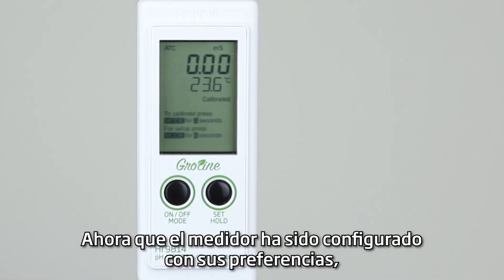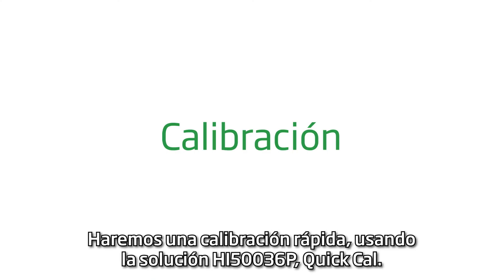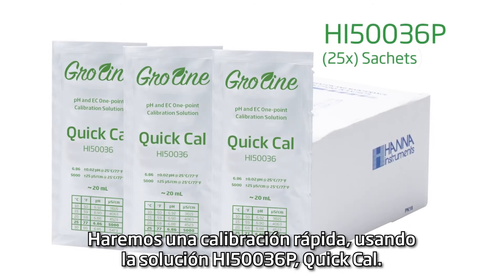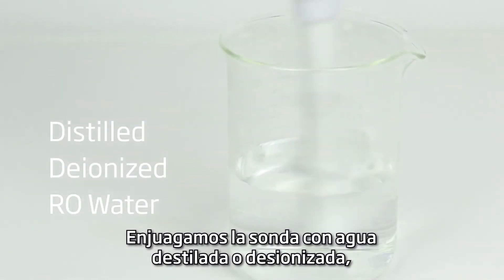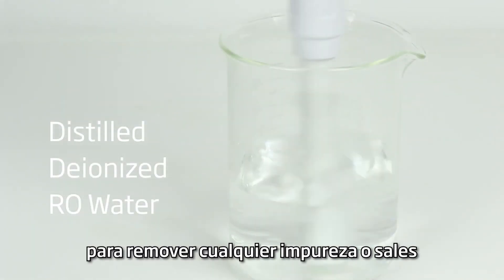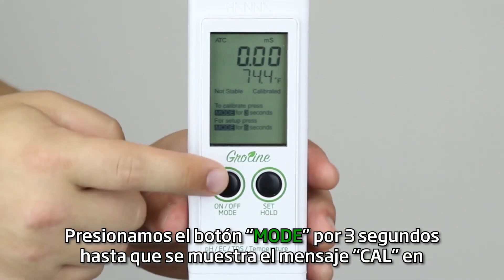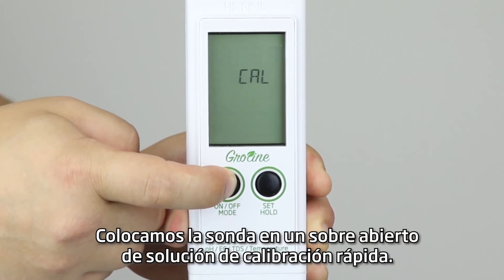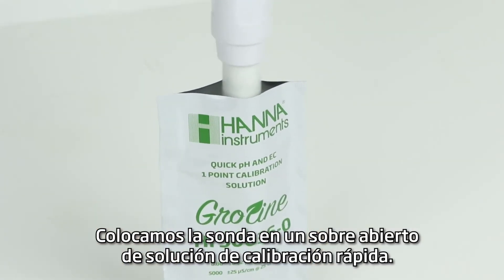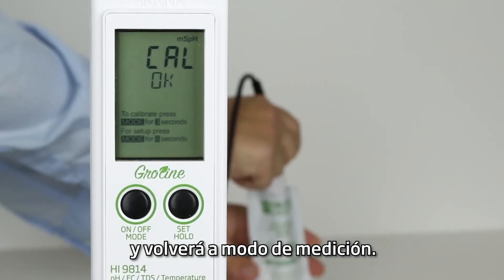Now that the meter is set up to your preferences, the next thing to do is calibrate the probe. We will be performing a quick calibration using the HI50036P quick calibration solution. Remove the protective cap and rinse the probe with distilled or deionized water to remove any impurities or salts that would contaminate the calibration solution. Press and hold the mode button for three seconds until CAL is displayed. Place the probe into an open packet of quick calibration solution. Once the reading is stable, the meter will automatically calibrate and exit to measurement mode.